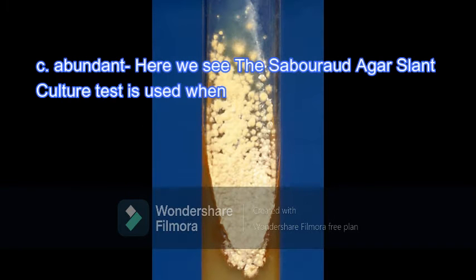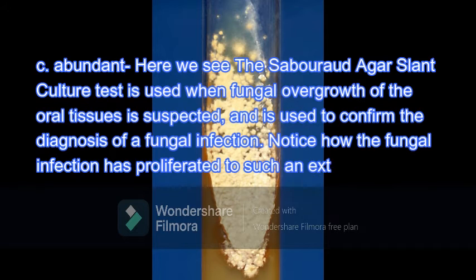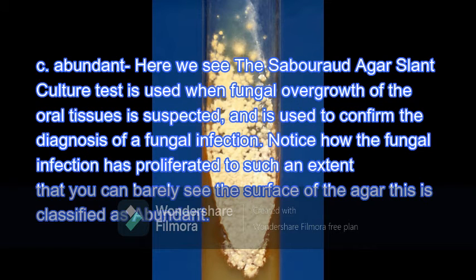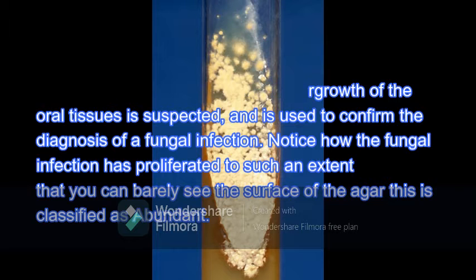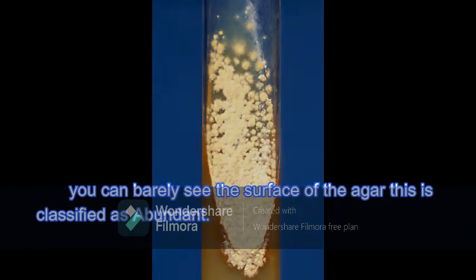The next one is abundant. Here we see the Sabouraud agar slant culture test, and it is used when fungal overgrowth of the oral tissues is suspected, and it is used to confirm the diagnosis of a fungal infection. Notice how the fungal infection has proliferated to such an extent that you can barely see the surface of the agar. This is classified as abundant.